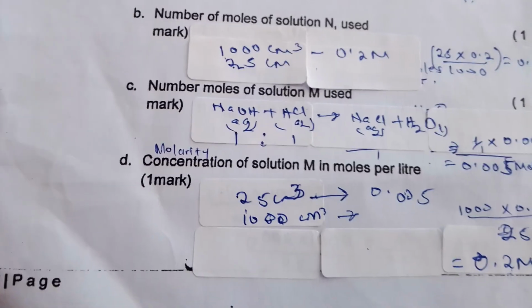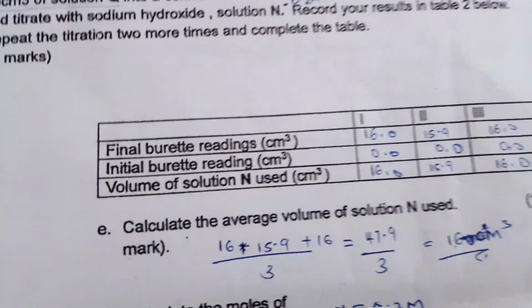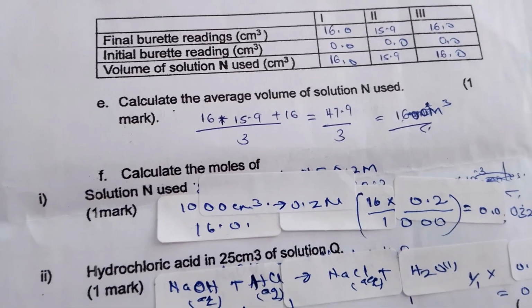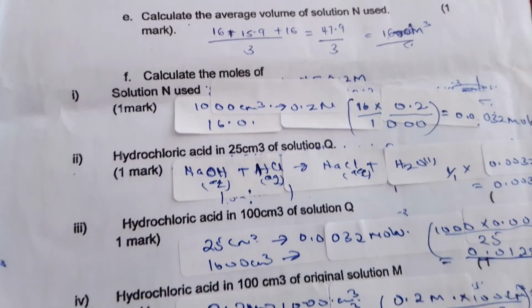I came up with the whole calculations, and then we went to part 2 of that question paper, and then we did our titration. We got on the second table 16.0 cubic centimeters as our final average volume, and then we did those calculations.